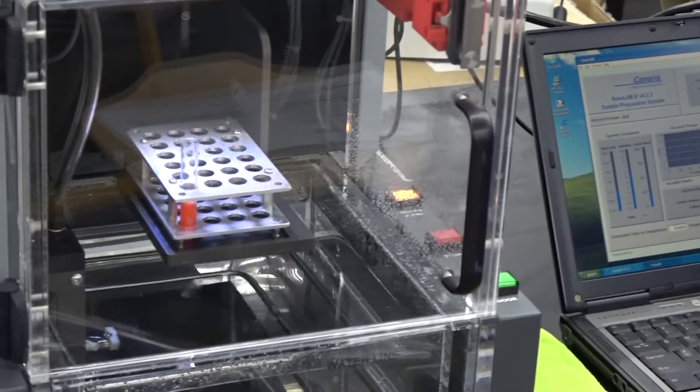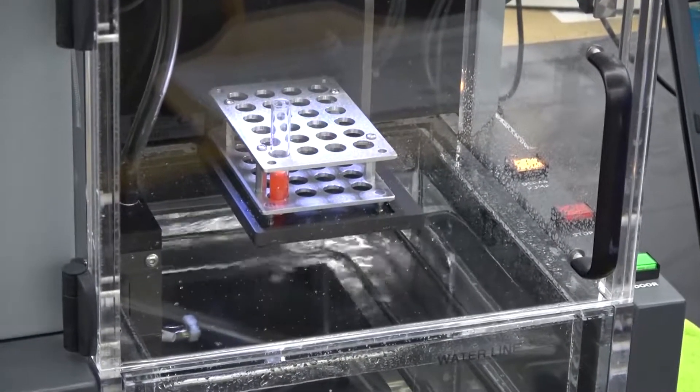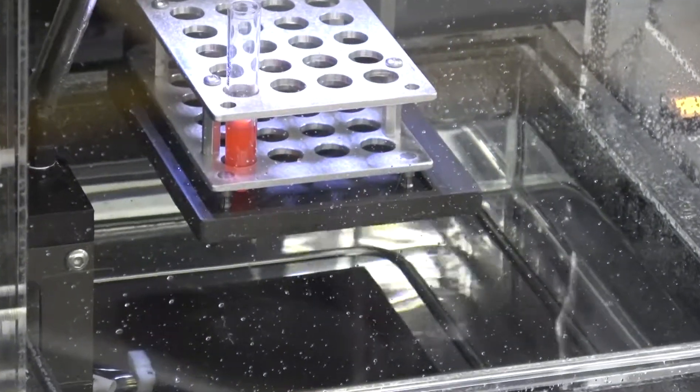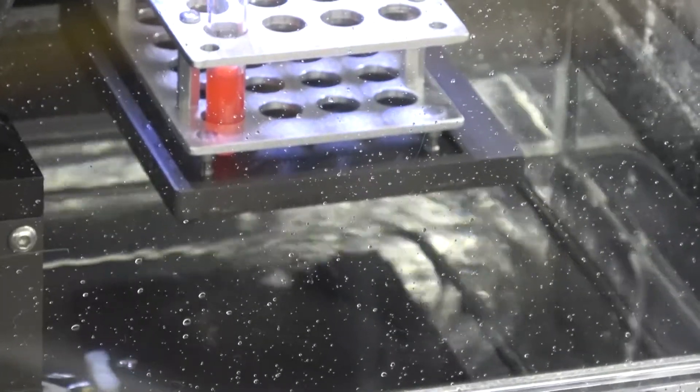The E210 is most appropriate for samples weighing less than 500 milligrams and volumes less than 5 milliliters in a high throughput environment. It is designed to disrupt and homogenize biological tissue, extract biochemicals, and accelerate reagent dissolution.